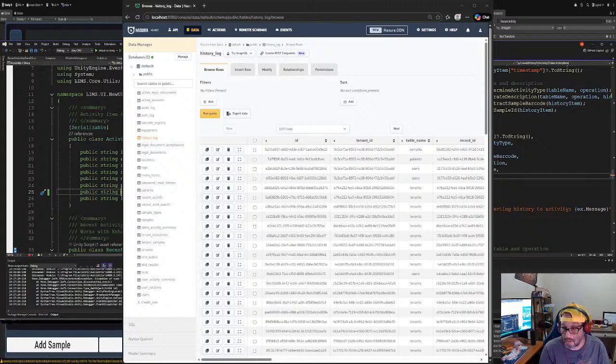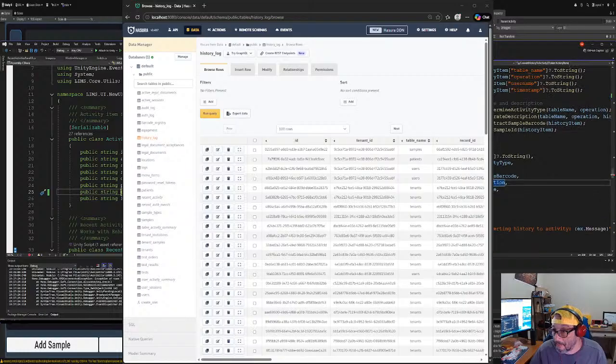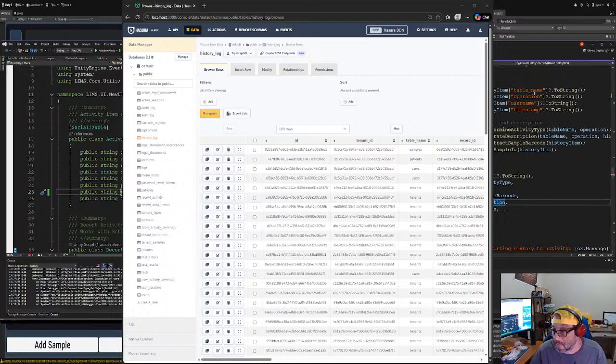Created at. So we get the created at. Let's just rename it created at.